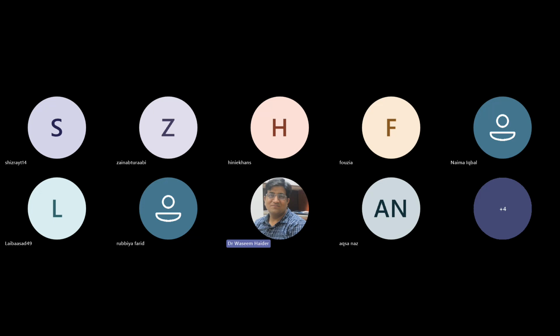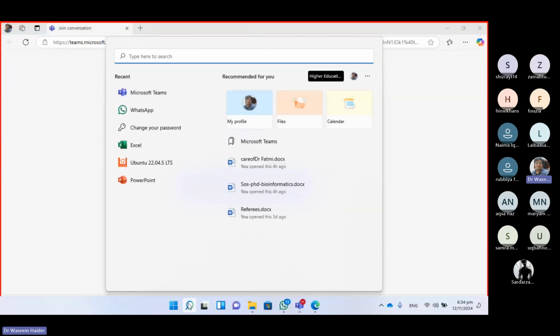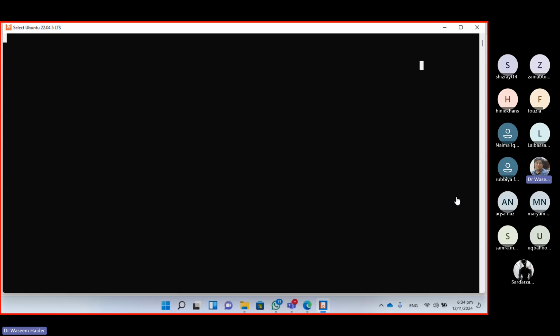Okay. So now let me get back to my other screen, and here we can practice Linux one more time, probably one last time. Then everything will be in Windows. So get back to Windows. So that's all about Linux which we've been using.